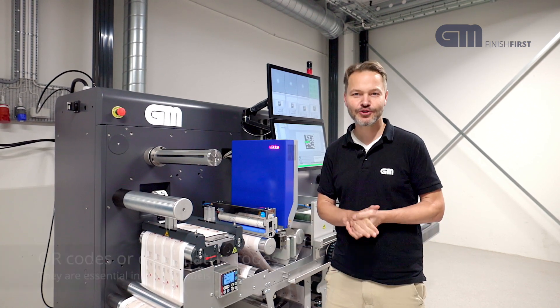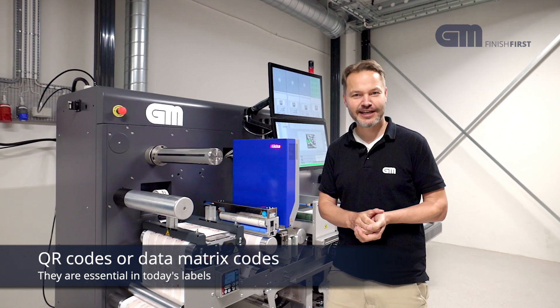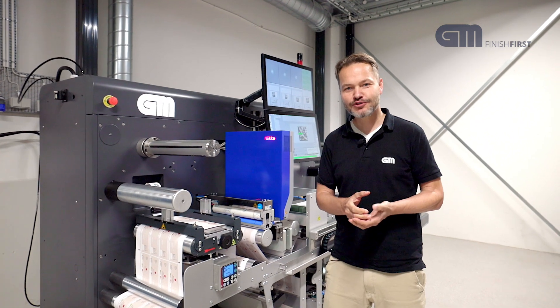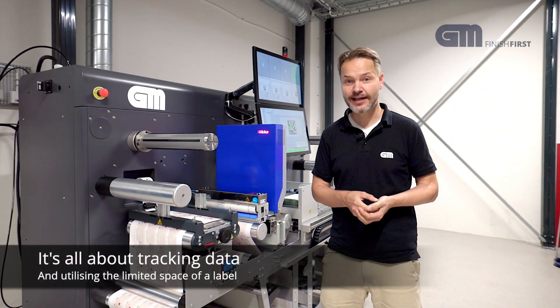Today we are going to talk about QR codes or data matrix codes. They are essential in today's labels. So why QR codes? Why data matrix codes? It is all about tracking and label size.